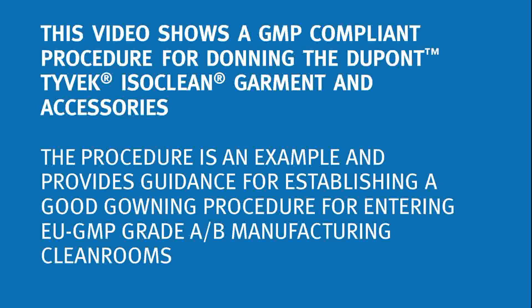This video shows a GMP compliant procedure for donning the Dupont Tyvek ISOClean garment and accessories. The procedure is an example and provides guidance for establishing a good gowning procedure for entering EU GMP grade AB manufacturing cleanrooms.